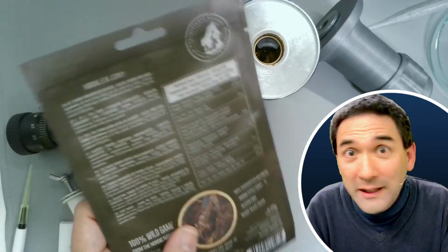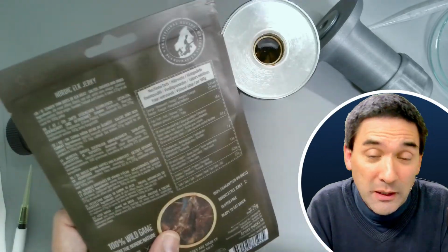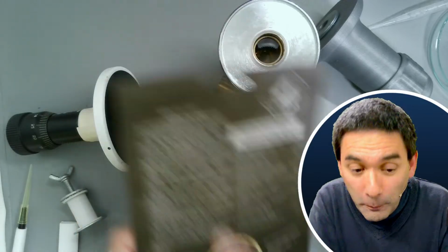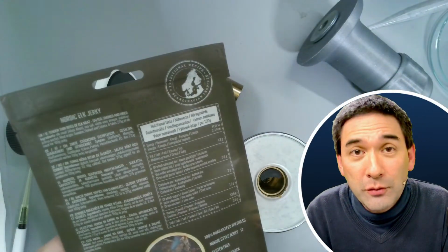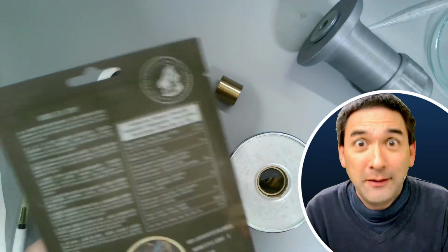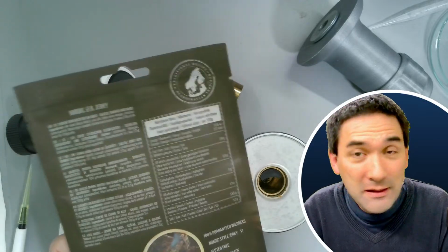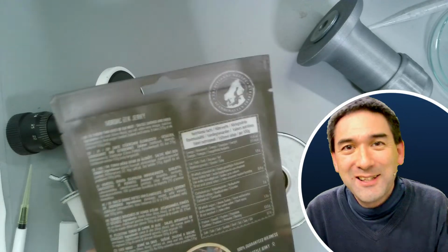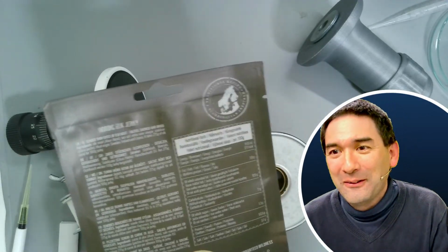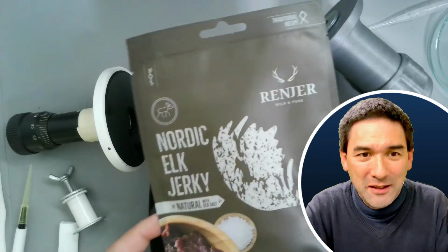I have not tried that yet. I've never eaten this before, and I don't really know how to process this. So what I'm going to do is I'm going to open it. You see it's packaged, and I'm going to try to cut it as well and put it under the microscope, and I have no idea what to expect. So maybe we're able to see something interesting. Maybe it's going to be a total disaster and we're not going to see anything at all. Well, that's part of the whole thing here. We're just going to find out how this actually works.